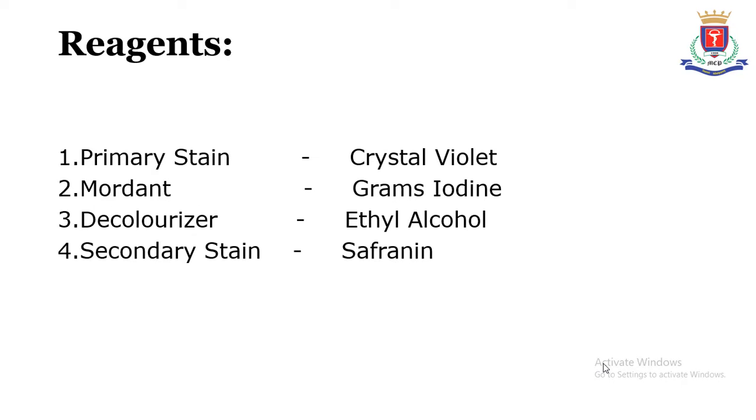The reagents required will be primary stain, that is crystal violet, mordant, that is gram iodine solution, decolorizer, that is ethyl alcohol, and secondary stain, that is safranin.